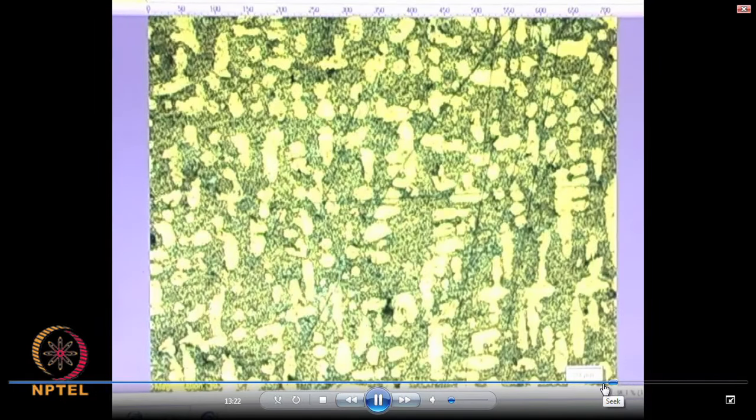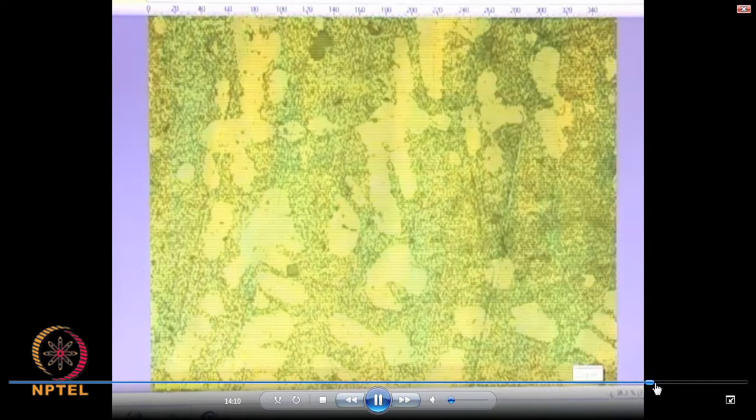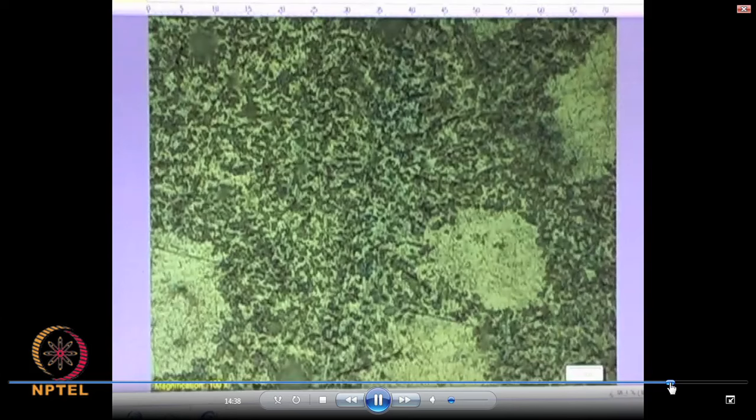This is the aluminum sample — a mass cast structure. You are able to see it is a cast structure. For people without a materials background: this is a solidified form of aluminum microstructure. What we call, in metallurgical terms, dendrites. As you go from lower magnification to higher magnification, much more clear details of the microstructure information become visible.